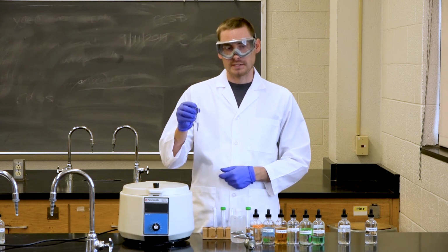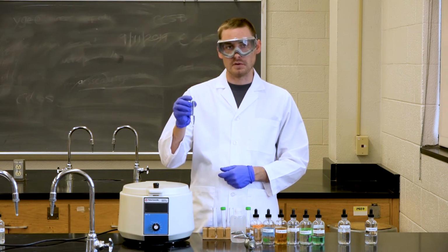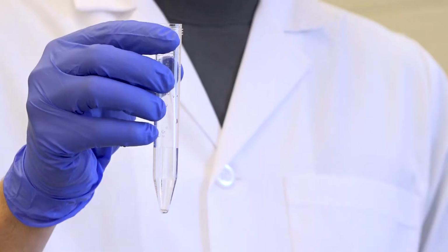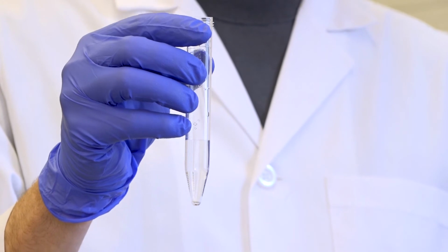Adding the water will raise the pH, which will allow lead chloride to go back into solution and will leave only silver chloride at the bottom. We can now heat this, which will promote the lead chloride to redissolve into solution.